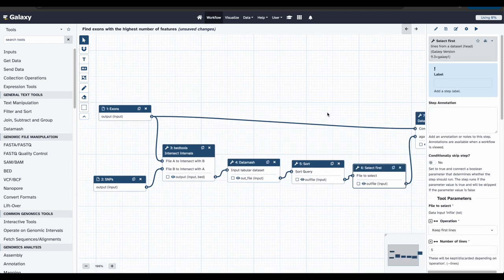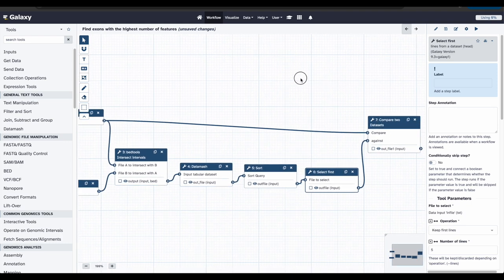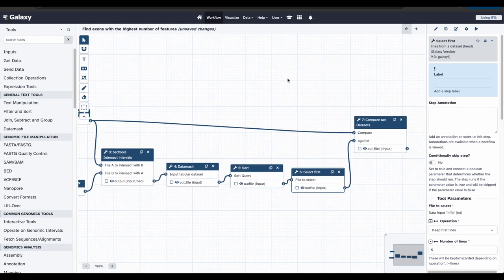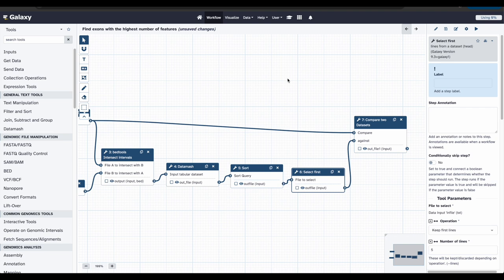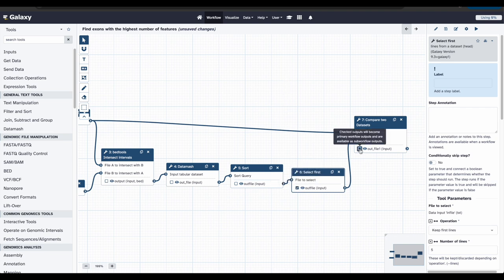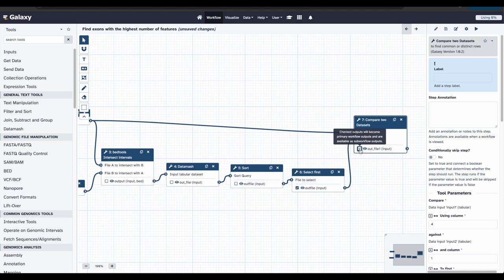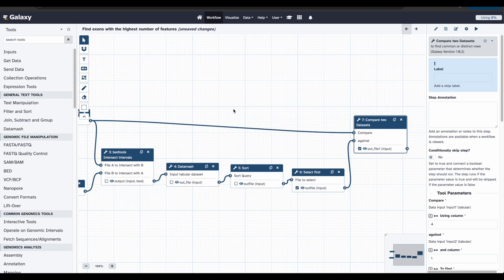For our workflow, we want to make sure to check the boxes for Outfile in the Select First and Compare Two Dataset Tools. We want to make sure that the rest are not selected. This makes it so that when we run the workflow, we will only see the two final outputs.